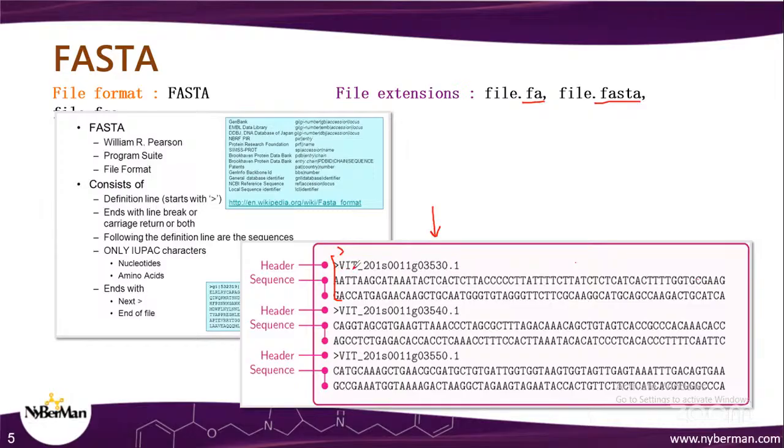Okay, so the header line will have the information of your sequence, such as which organism the sequence is from, which sequencer captured this particular sequence, and which library was used for this particular sequencing. Okay, so we will understand the library further when we go deeper into this type of data, once we retrieve the data from databases, and I will explain it to you.